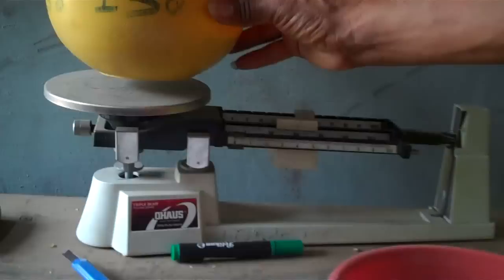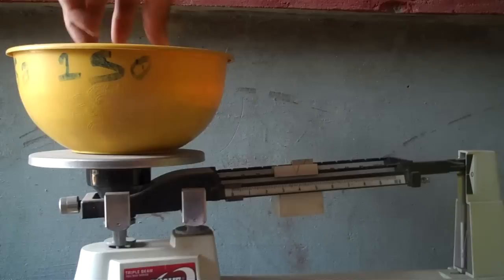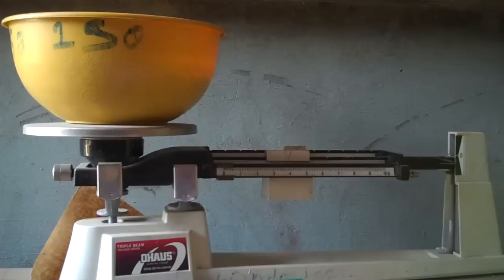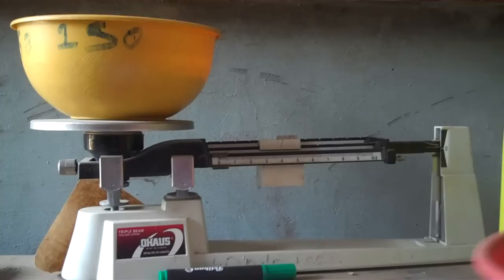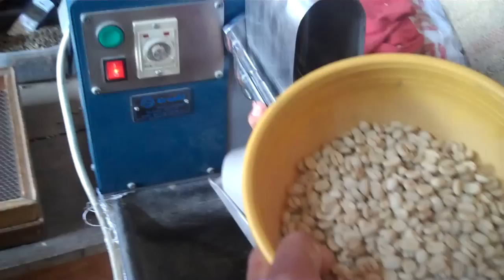Don Miguel is weighing out 250 grams of pergamino and then he's going to put it in a machine that takes off the outer husk — converting the pergamino to what's called oro, which is the green coffee that goes into roasters. Once roasted, people can grind it, brew it, and drink it. This dehusking process is called triar.